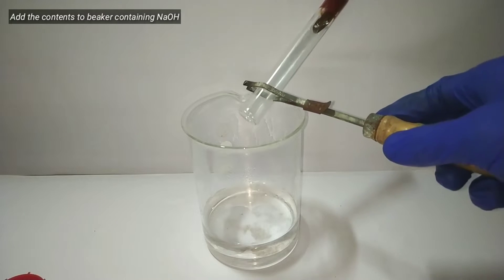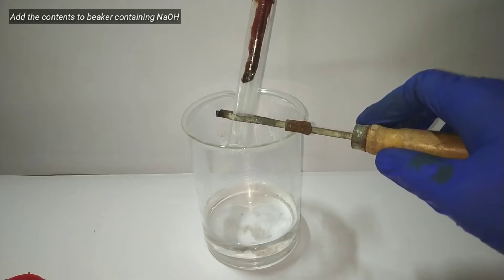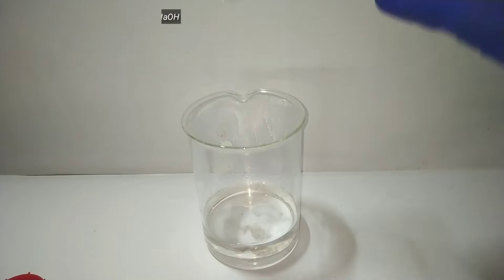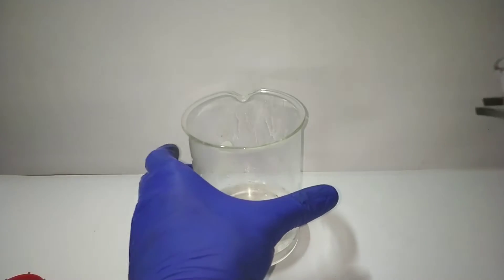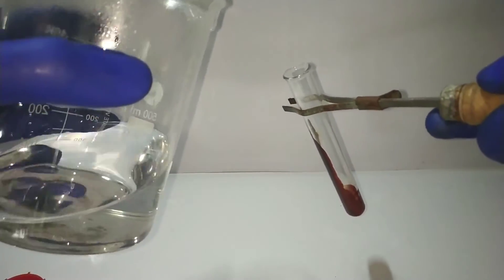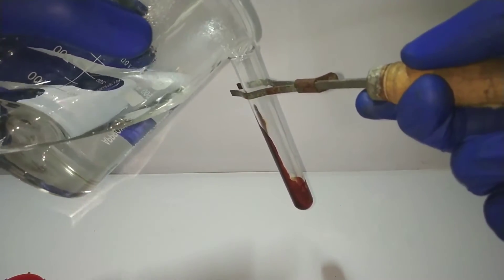Now pour the contents to 5 molar sodium hydroxide solution. I tried to pour my contents but it immediately got solidified, so instead I added sodium hydroxide into the test tube. Either way, we want the resultant solution to be alkaline.